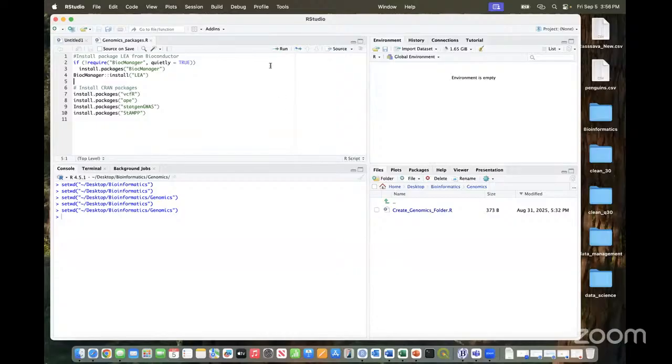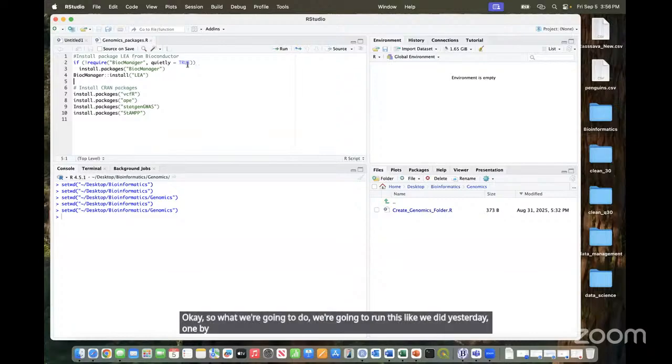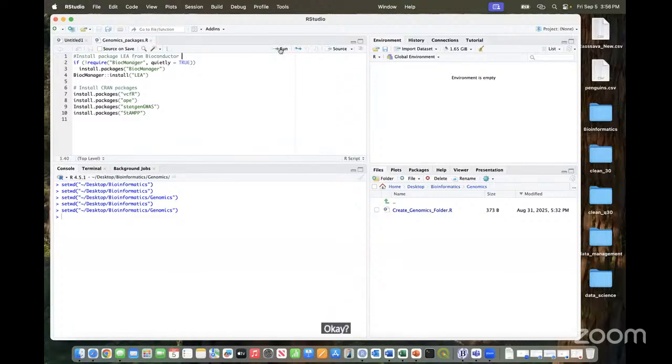Okay, so what we're going to do, we're going to run this like we did yesterday, one by one. Okay? So we're going to run this one by one.